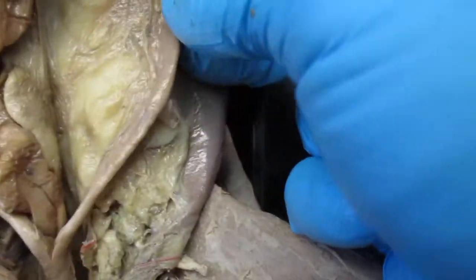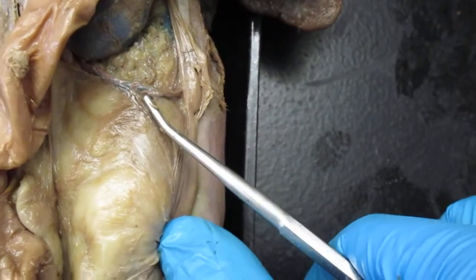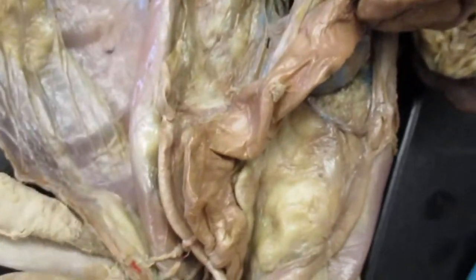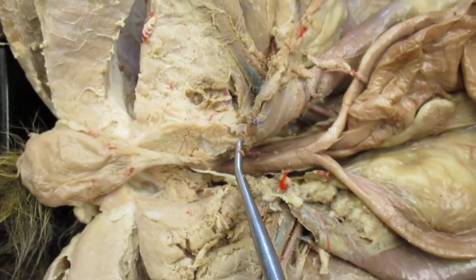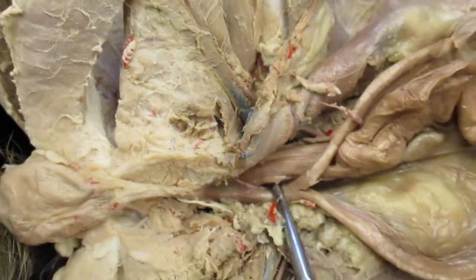And you can see a little bit better on this side. There you go. Ovarian artery and vein. Okay? And right here we can see the urinary bladder. You can see the urethra, vagina, and then the rectum.